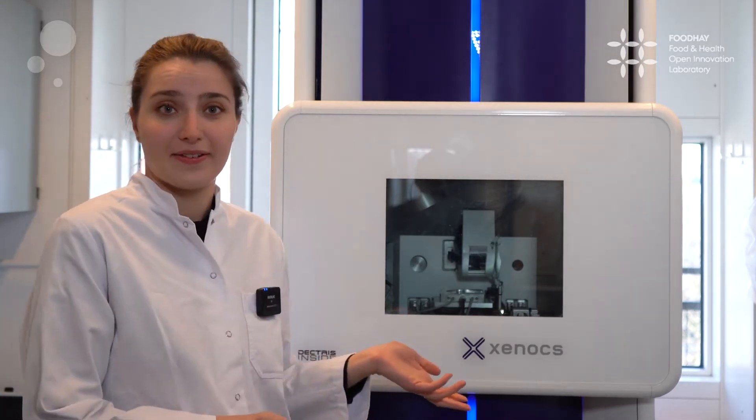Hi, my name is Sófél Szentmári. I'm a PhD student here at Copenhagen University at the Department of Food Science. Today I would like to take a few minutes to introduce you to this piece of equipment that we have under our research with FOODHEY.